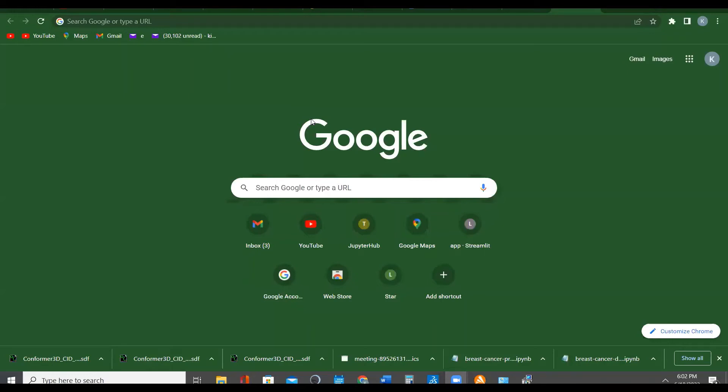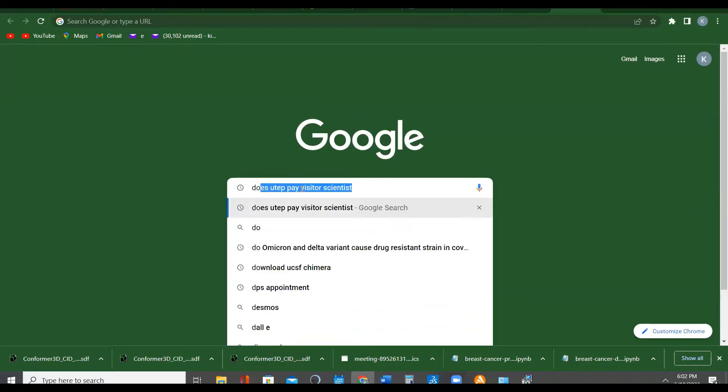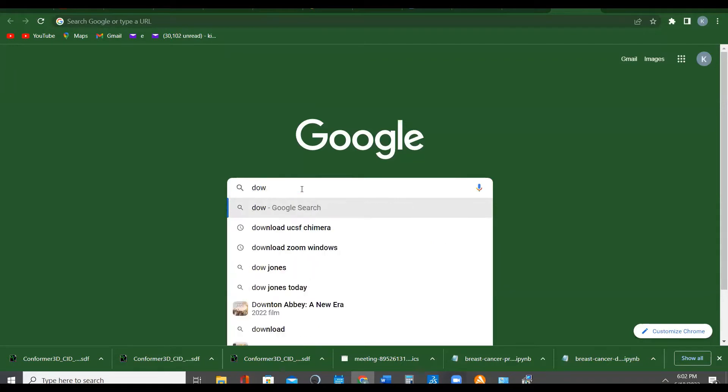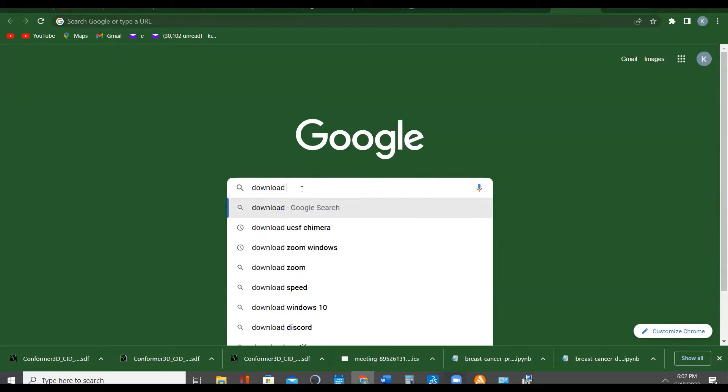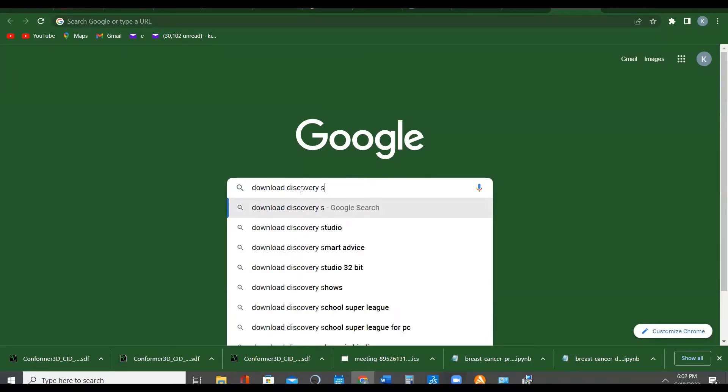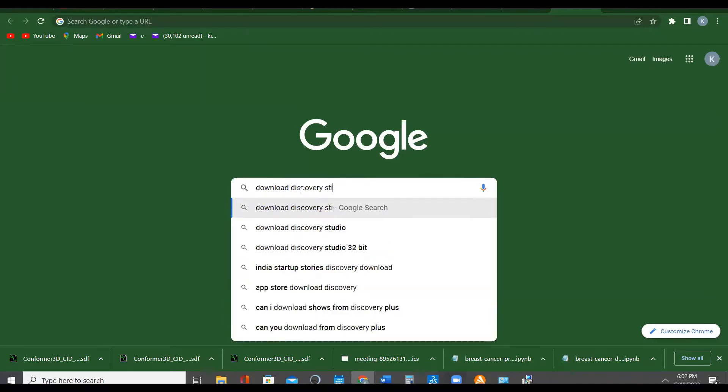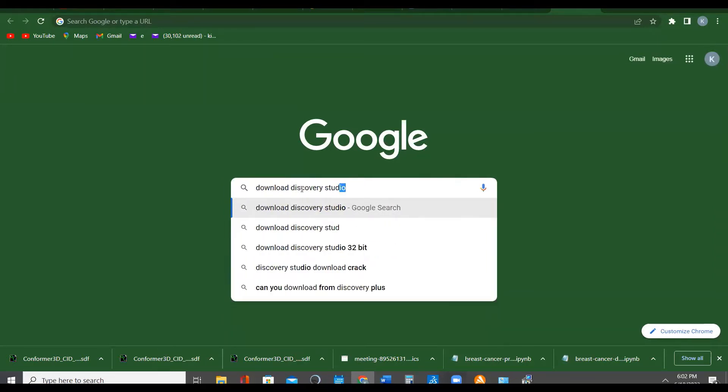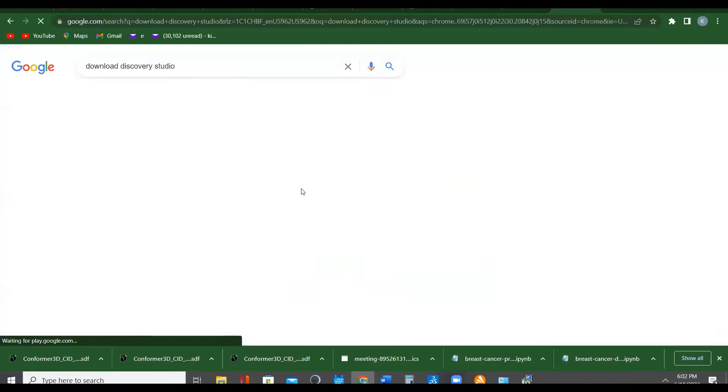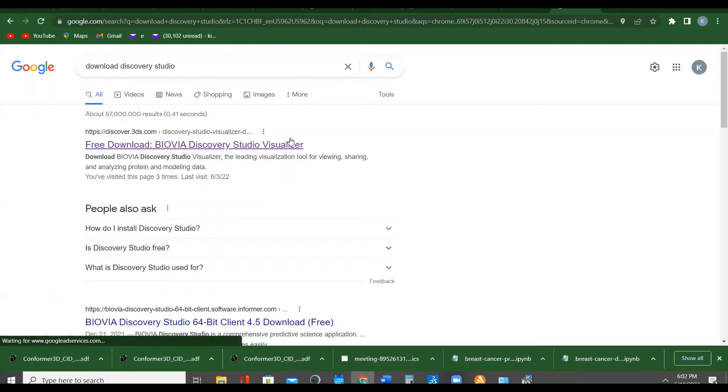To download and install BIOVIA Discovery Studio, you need to open your browser and type 'download Discovery Studio'. Just type that and click enter. You will see it. Click download BIOVIA Discovery Studio Visualizer and click on it.